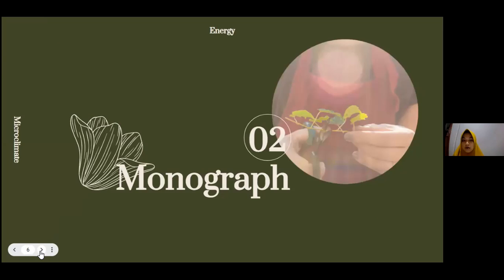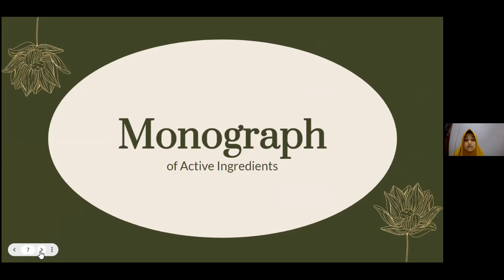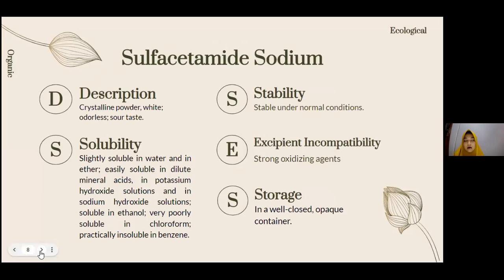The next is monograph. The first is monograph of active ingredients. Our active ingredient is sulfacetamide sodium. The description is crystalline powder, white, odorless, sour taste.